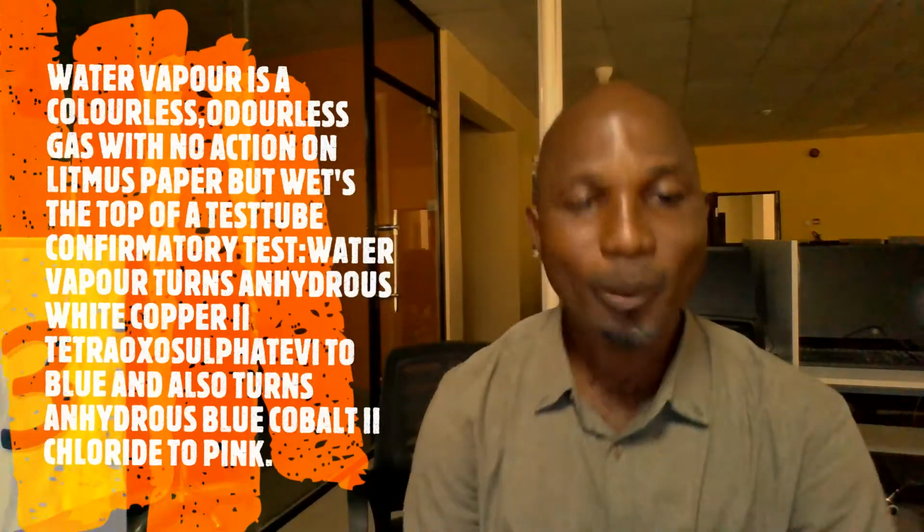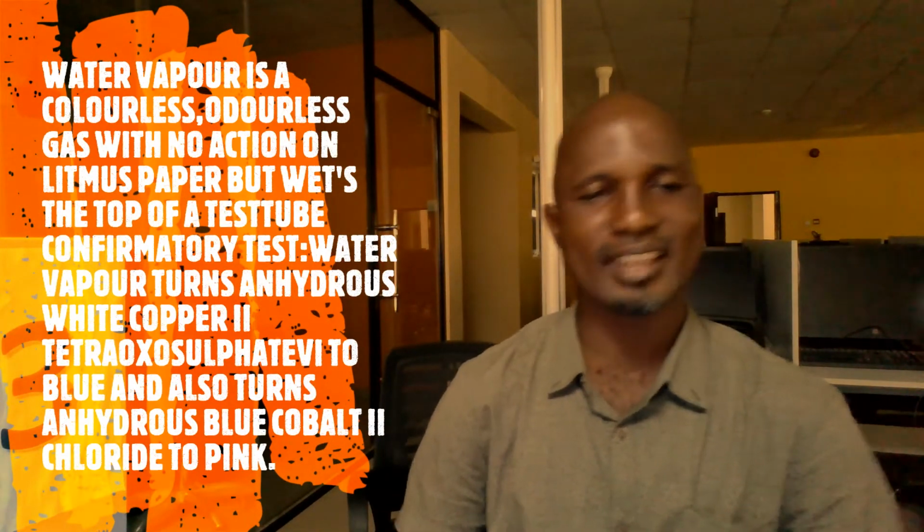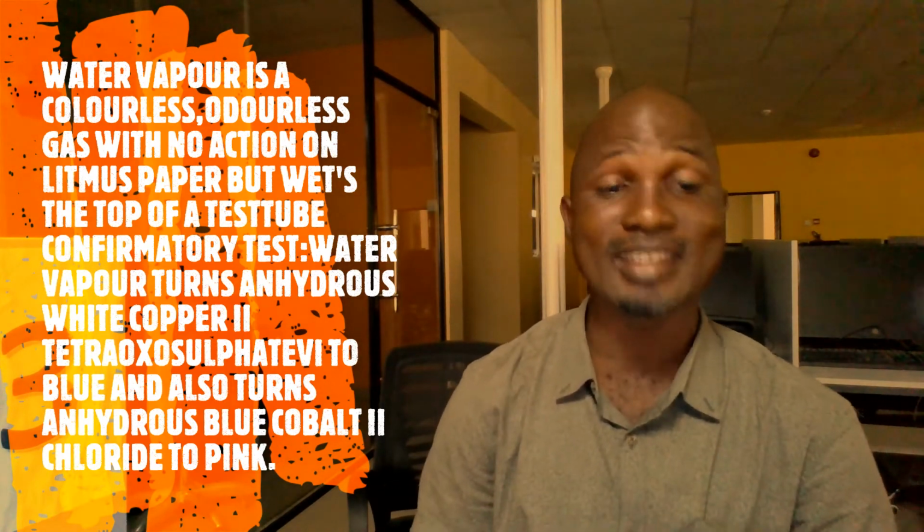My distinguished students, at this point I'll be rounding up with the last gas, which is water vapor. Water in gaseous form is called water vapor. When water vapor is given off in the test tube, one of the ways to know is that the test tube becomes wet. Yes, it becomes wet at the tip where the temperature is less than where it's coming from.